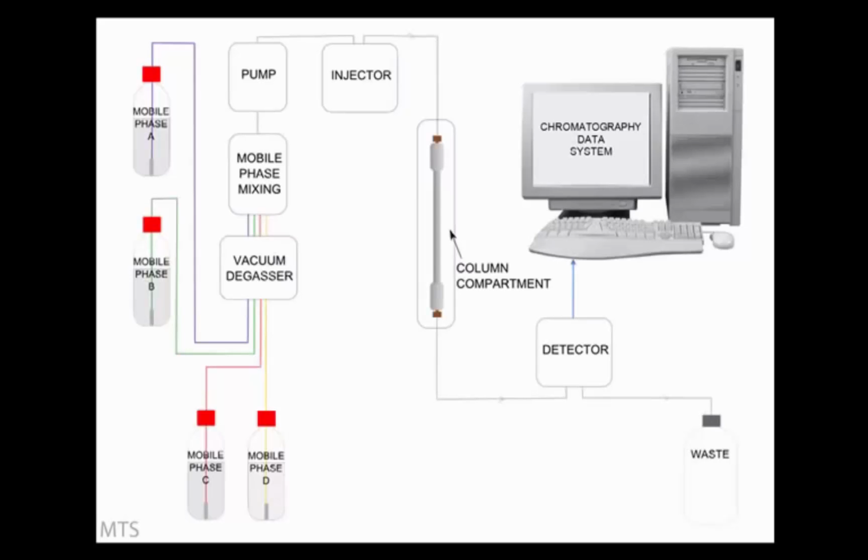So what happens during an analysis? The mobile phase is flowing through the system from the mobile phase reservoir to waste. We will inject a mixture of 3 components, shown here using 3 colours, pink, green and blue. At the head of the column, when the sample first encounters the stationary phase, we have a mixture of all 3 components. The equilibrium between each component, the stationary phase and the mobile phase is different for the 3 colours in the mixture. In our mixture, the pink component spends more time in the mobile phase relative to the green and the blue and travels through the column quickest.